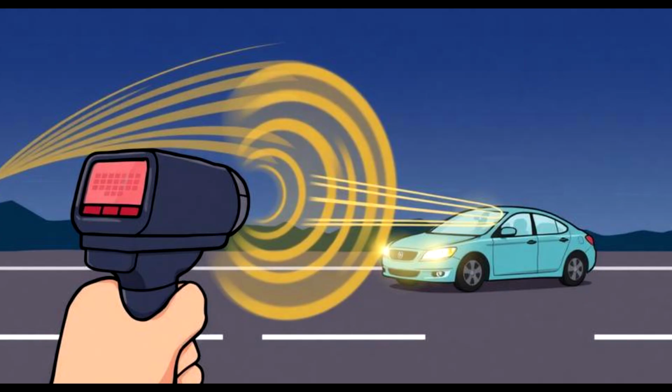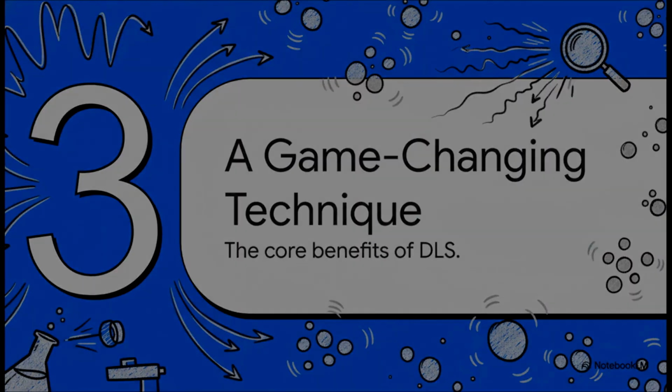Back to our radar gun analogy. The scattered light intensity fluctuations in DLS differ based on particle size, much like the reflected and detected radar signals from a moving car differ based on the target car's speed. By analyzing those light intensity fluctuations, the instrument can precisely calculate the particle size by determining the particle's diffusion coefficient.